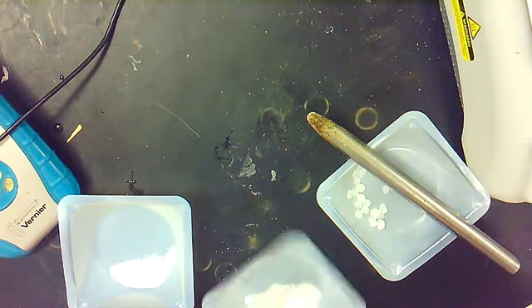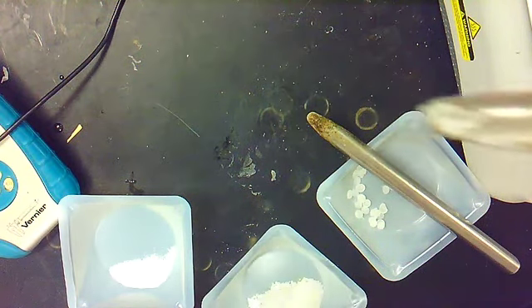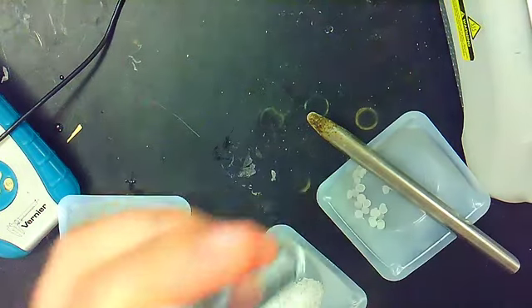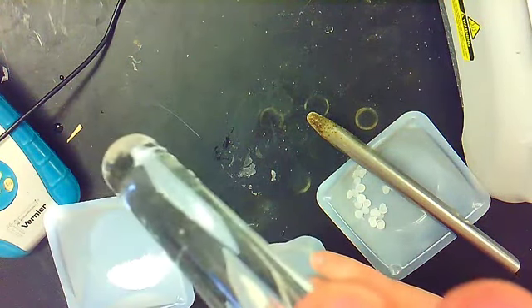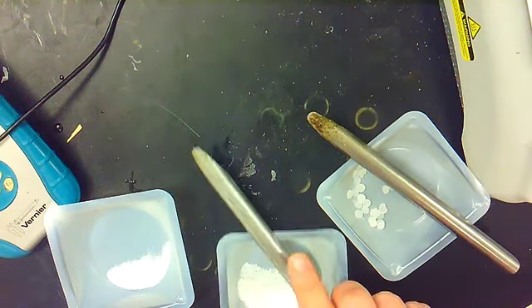All right, test tube 2. Again, just putting in a little bit. Okay, these are bigger granules, right? So you can see them settle out. But let's see what happens.